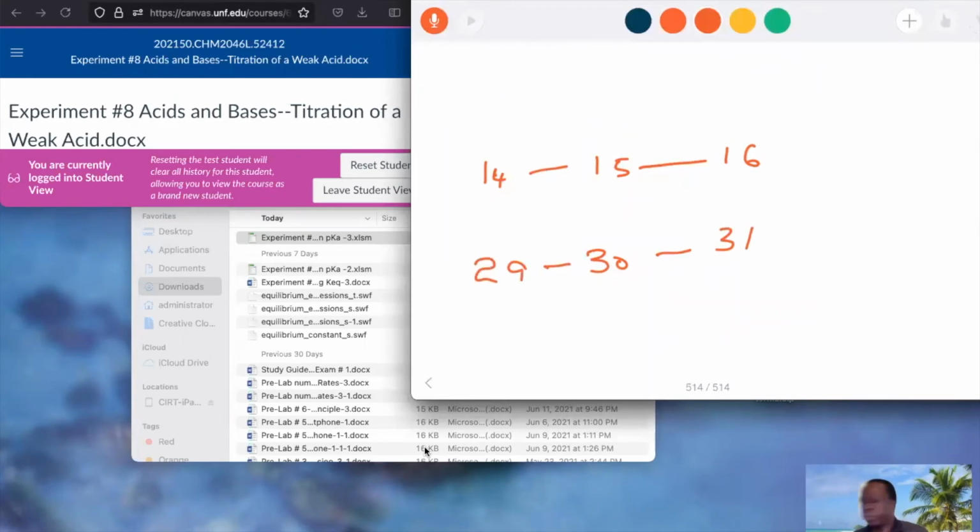So you're going to have 2 ml in this region, you'll add 1 ml, 1 ml, that is 2 points within half equivalent, 2 ml within half equivalent, and 2 ml within the equivalent.